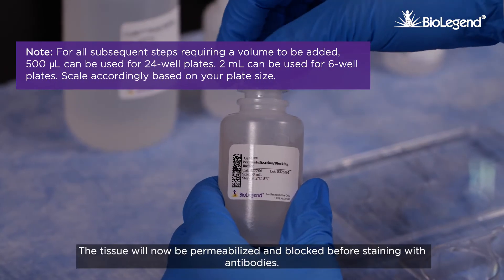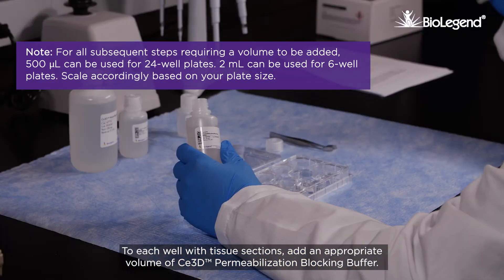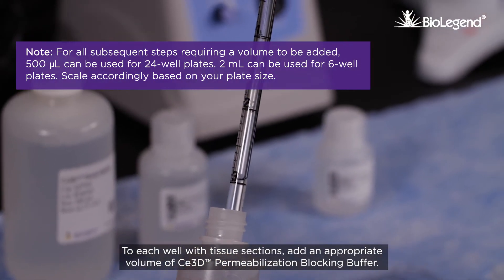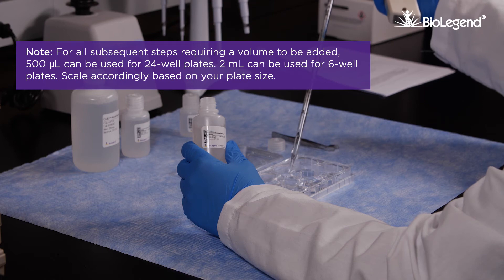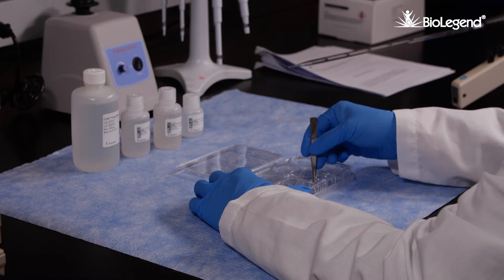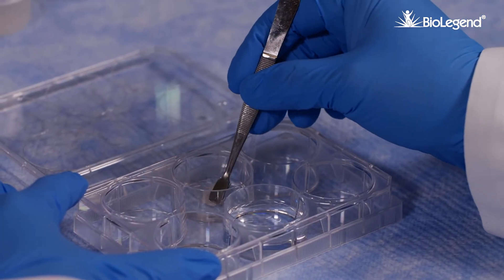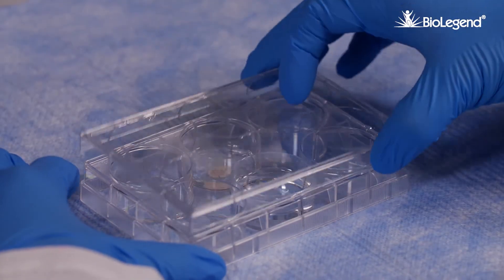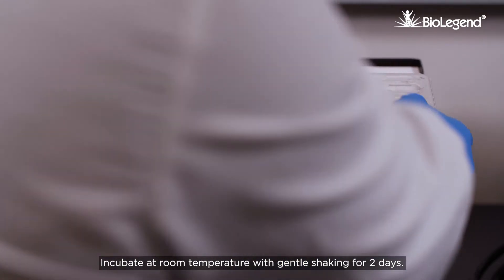The tissue will now be permeabilized and blocked before staining with antibodies. To each well with tissue sections, add an appropriate volume of C3D permeabilization blocking buffer. Incubate at room temperature with gentle shaking for two days.